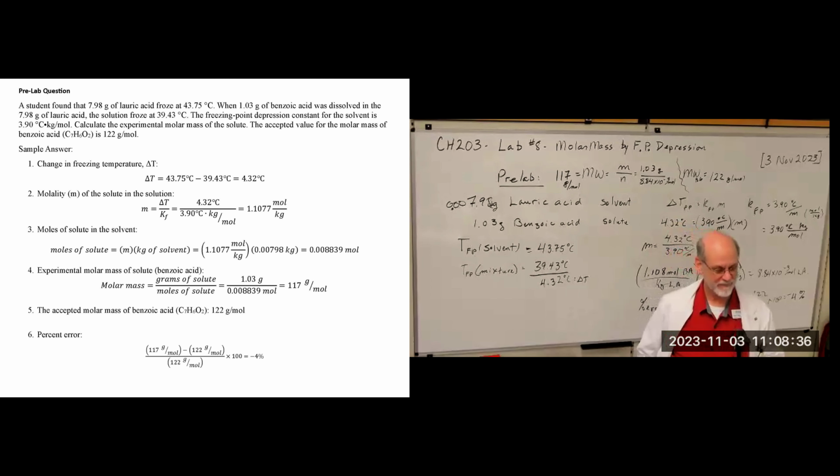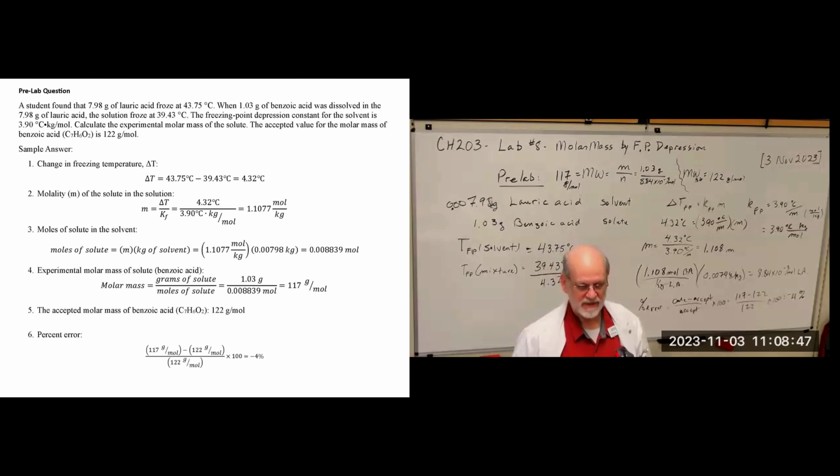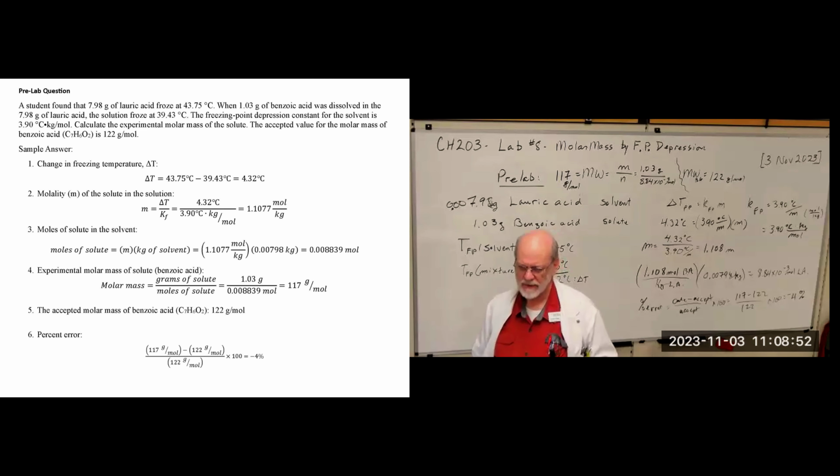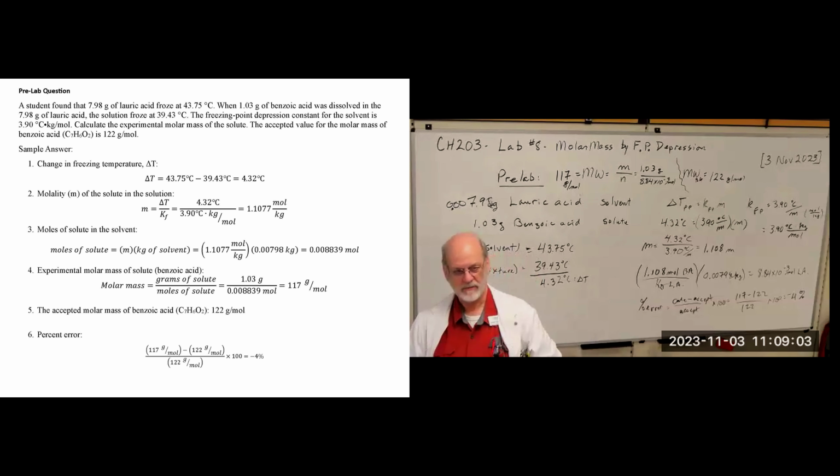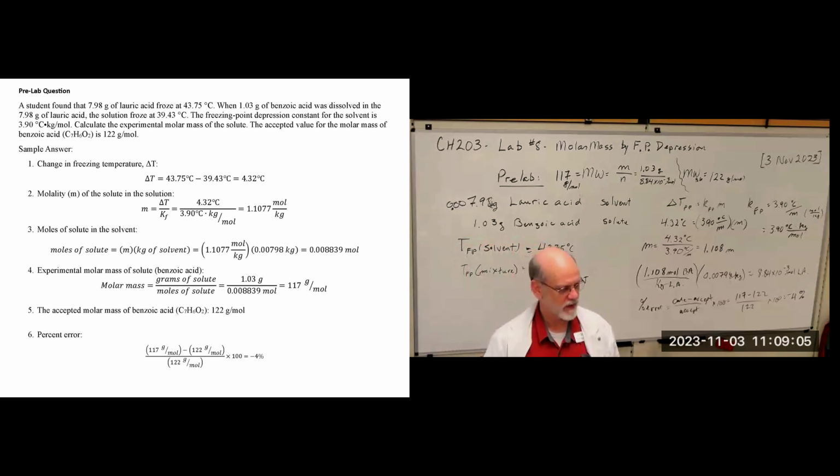All right, safety concerns? Hot, right? Yeah, boiling water is hot. Heat is primarily it. Benzoic acid, right? These things, they can give off some dust. Lauric acid is not a problem. Benzoic acid can be a problem with the fine particles if you breathe them in. So you just keep your distance. It'll be all right.